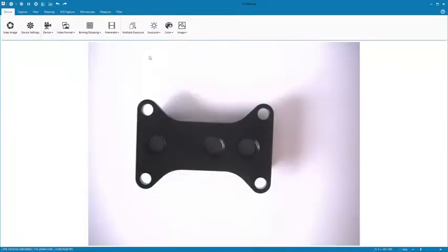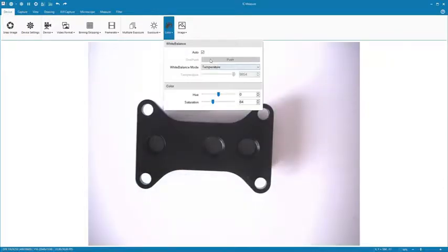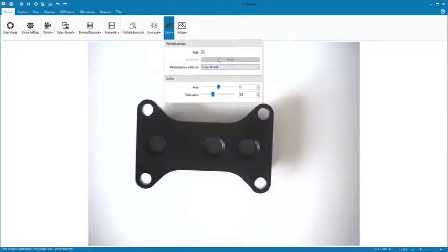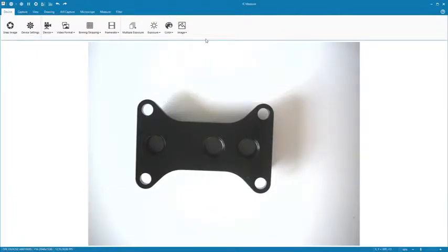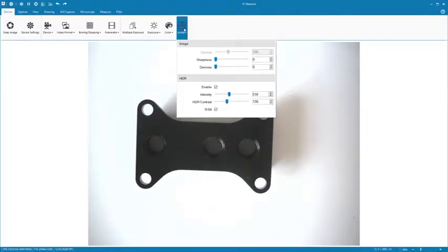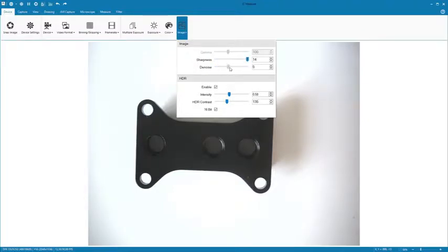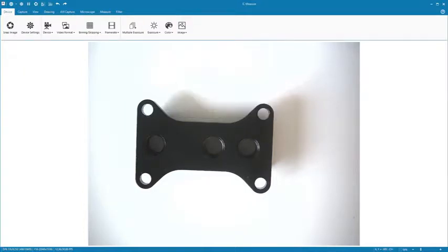Under Color, you will find a white balance option as well as functions for adjusting hue and saturation. Adjust image sharpness under Image. The Denoise Filter lowers chroma and luminance noise without loss of sharpness. All image details remain intact.